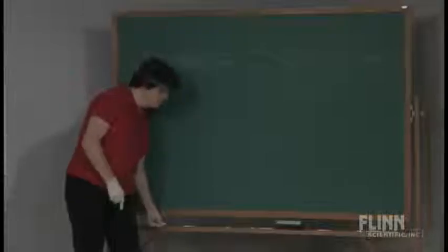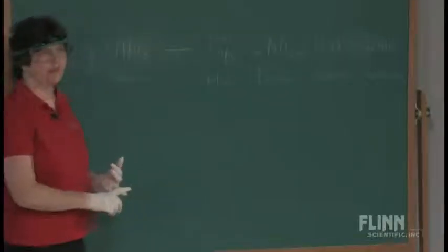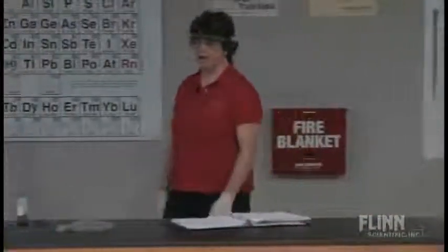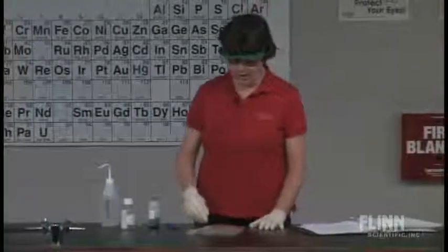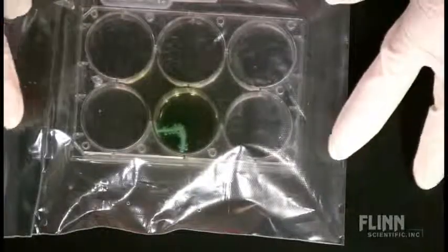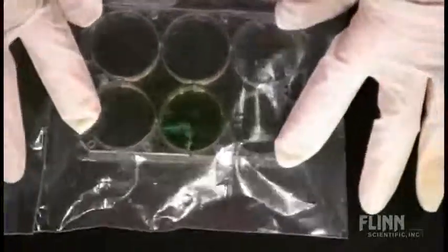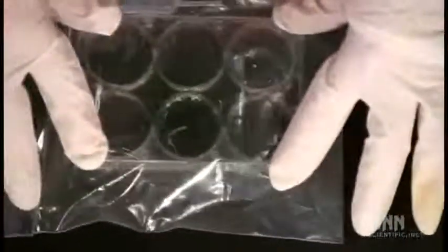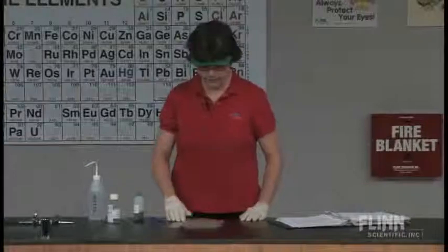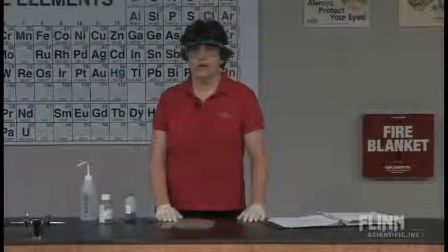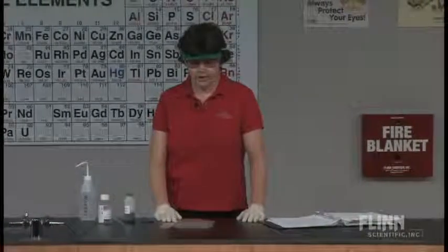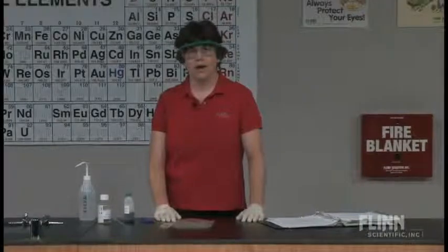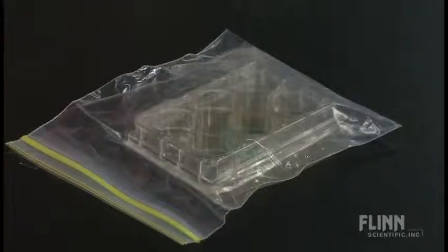So now we've identified a new substance. We know its color and its phase at room temperature. Back to the bag — we're still bubbling, and we want this reaction to go to completion. I'm going to mix it up just a little bit and get some more copper exposed. You really do want this reaction to go to completion because you don't want any leftover acid in there.